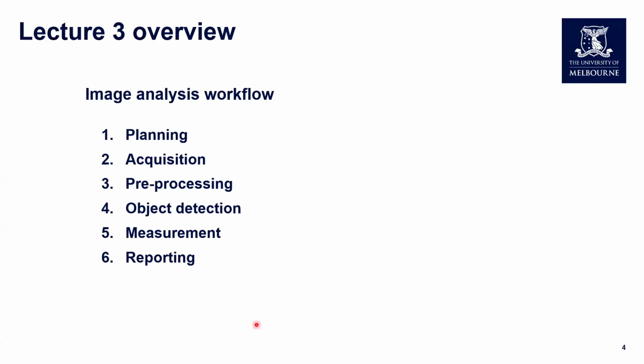So in this talk, I will cover the essentials of image analysis workflow in 6 stages, starting from the planning, acquisitions, pre-processing, object detection, measurements, and reporting. I will also explore this with a couple of example workflows.